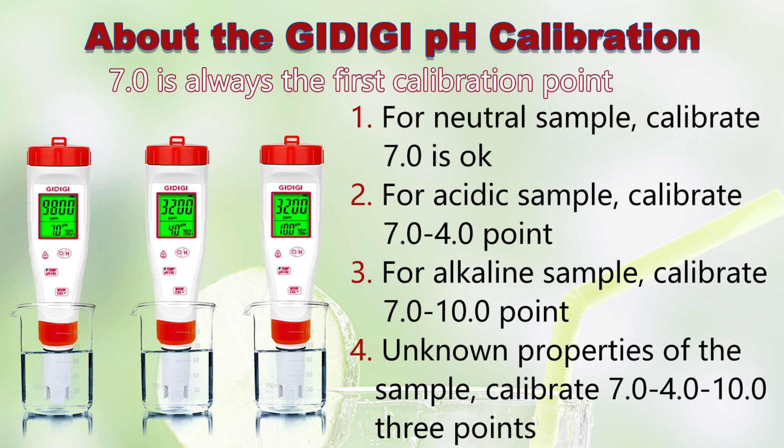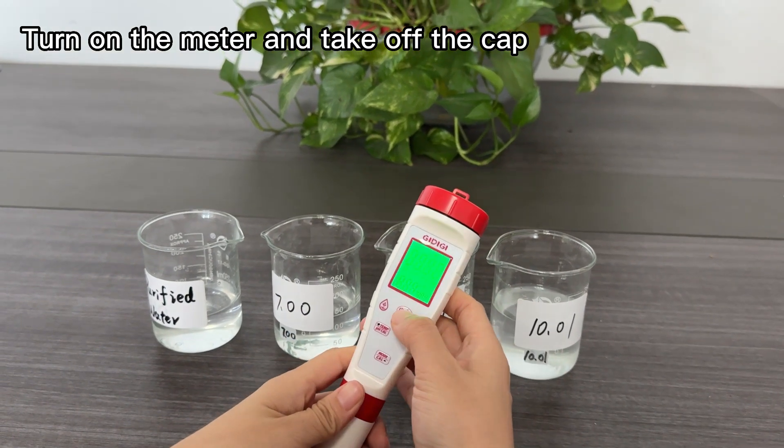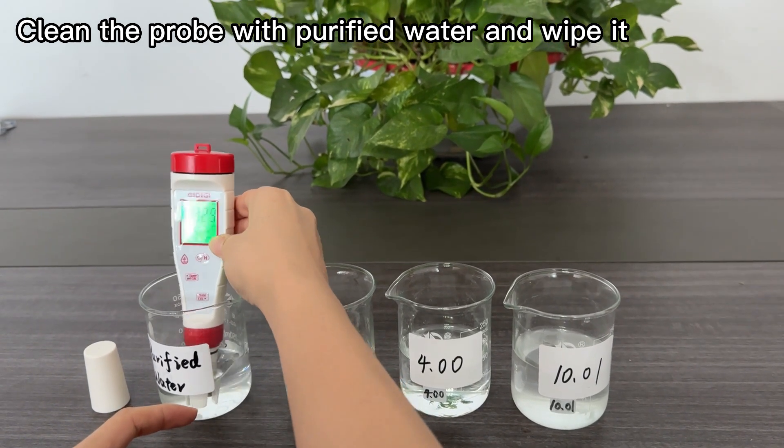Please choose the suitable pH calibration according to your needs. Turn on the meter and take off the cap. Clean the probe with purified water and wipe it.